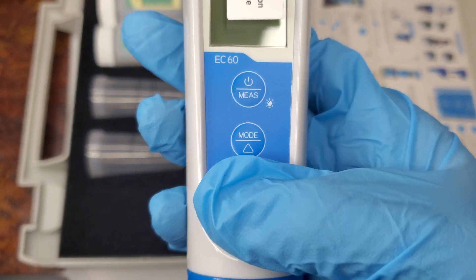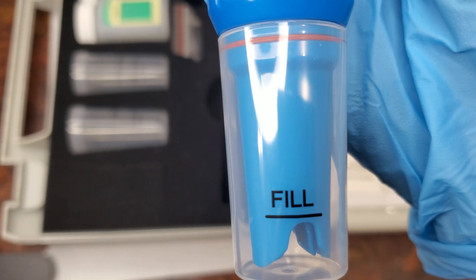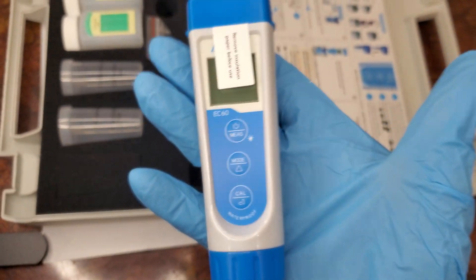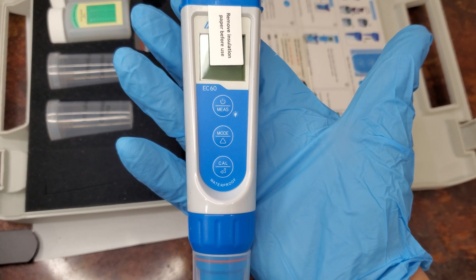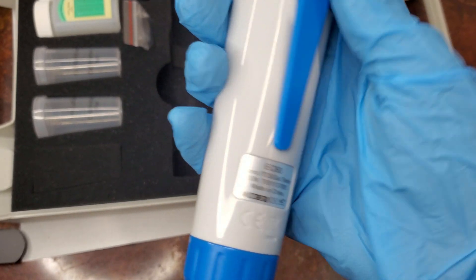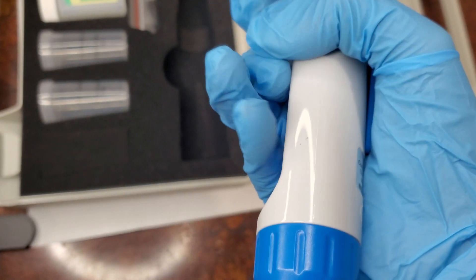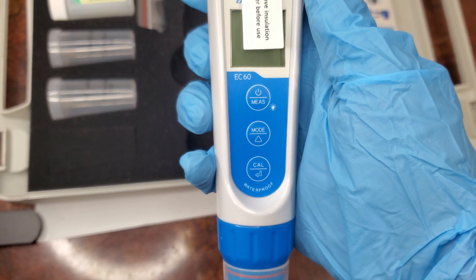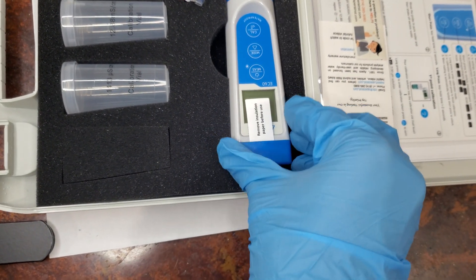This is a quality tool for any cannabis grower. Fill the probe cap with distilled water when the device is not in use. A solid device indeed.